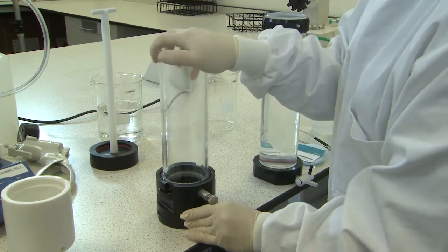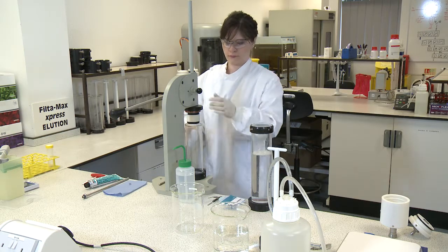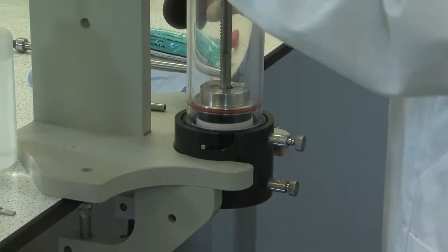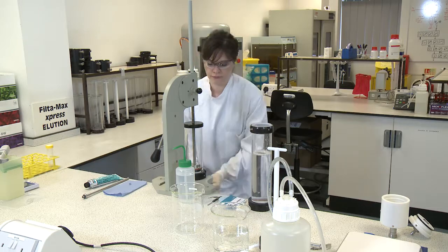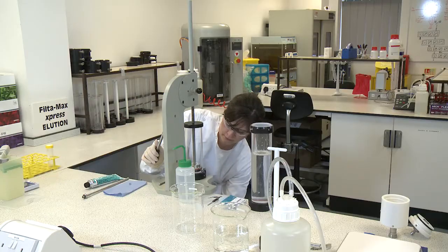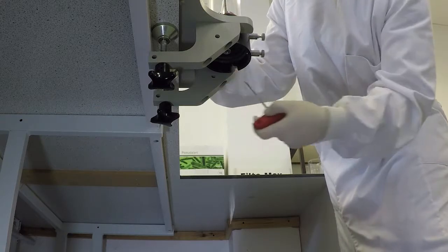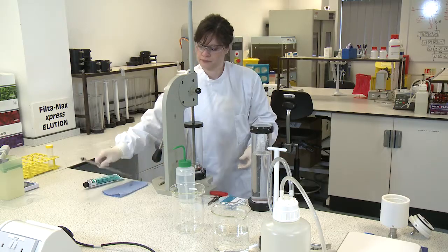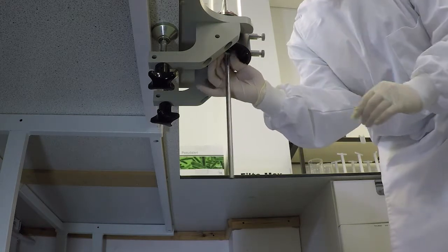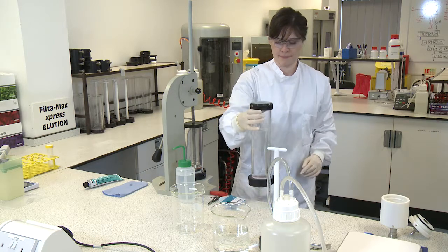Attach the elution tube to the quick connect. Slide the quick connect and elution tube into the jaws of the wash station. Release the locking pin and lower the plunger handle down until the filter module sits at the bottom of the elution tube. Unscrew the module bolt through the quick connect using the Allen key. Note that you may need to apply some pressure on the handle while removing the bolt. Attach the steel tube to the underside of the quick connect. Attach the assembled concentrator tube to the underside of the quick connect.